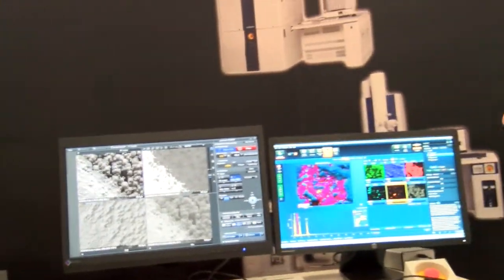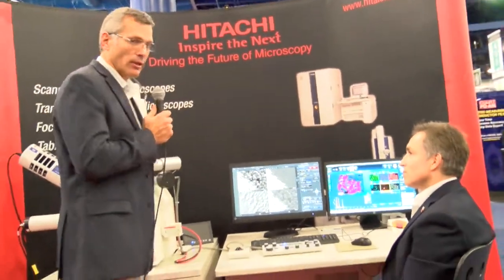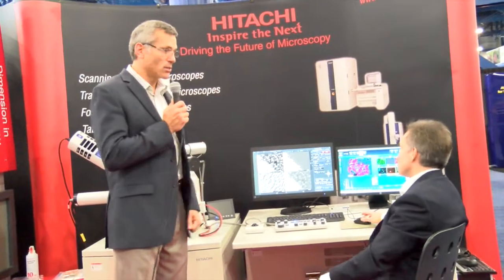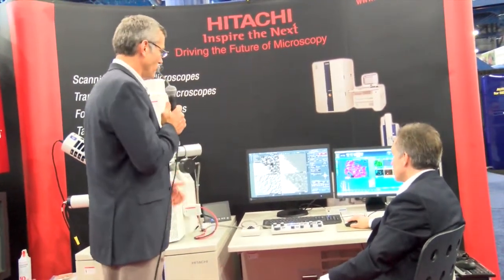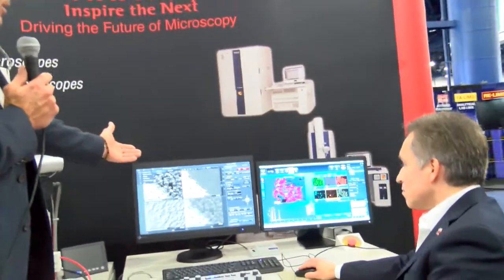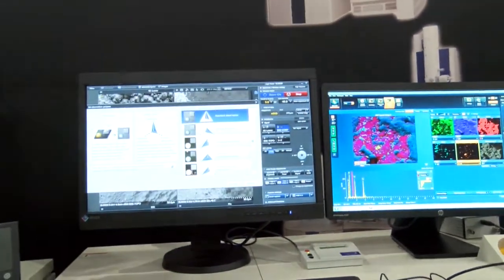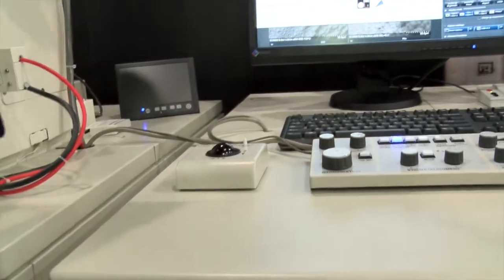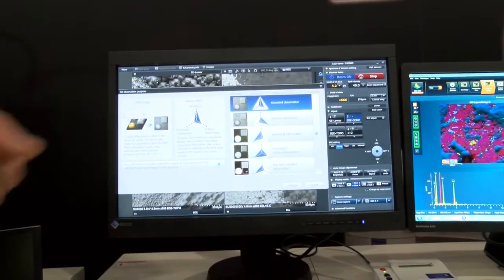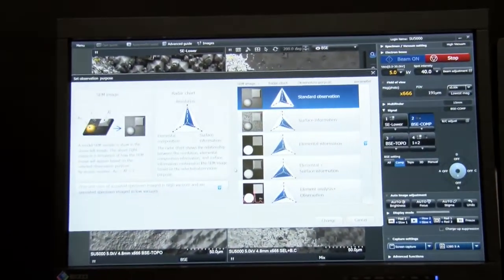Mike's going to also do a quick overview. The system has two different modes — we call it our EM Wizard, which gives you the ability to use advanced mode as well as standard mode. For advanced operations, you can use the full interface with a mouse click and also with a handset. And here Mike has pulled up the standard user interface, which has the ability to have predetermined preset selections.